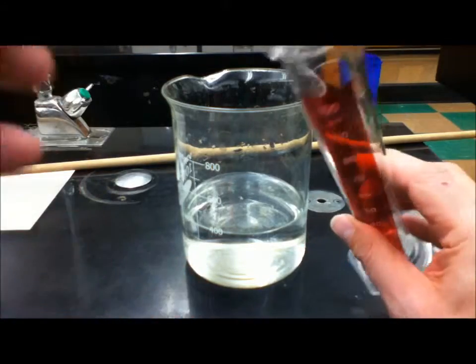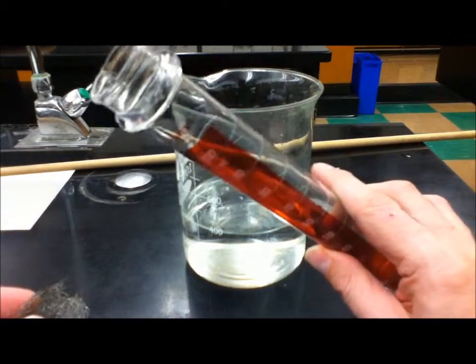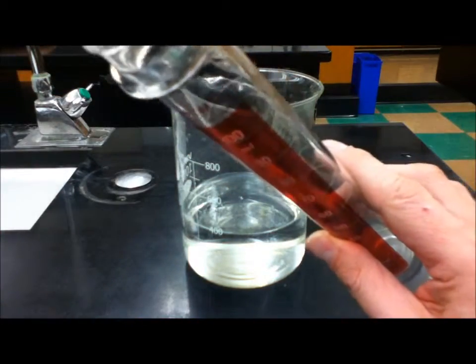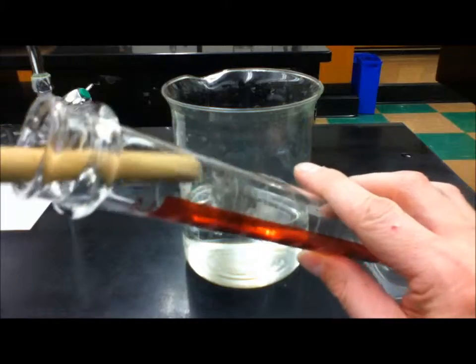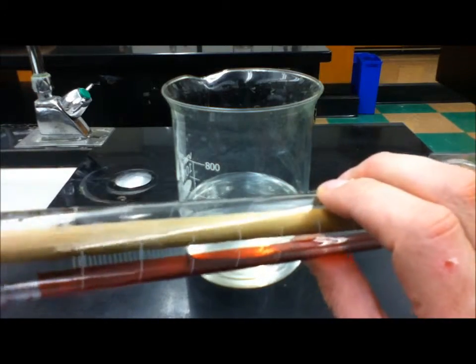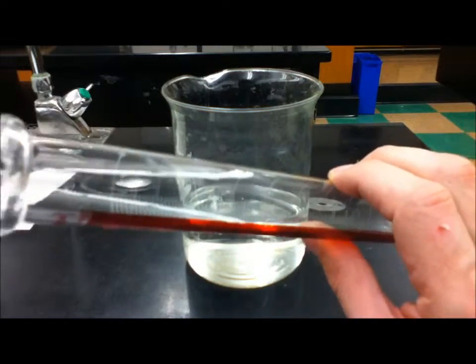So what we're going to do is take a hundred mil graduated cylinder and push our iron wool using a stick here, because this cylinder is pretty long, to the bottom of the cylinder, not the flask.